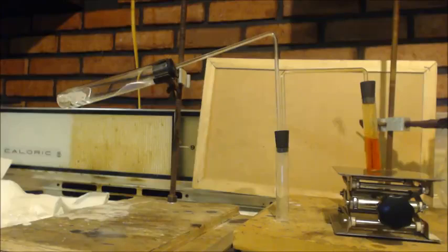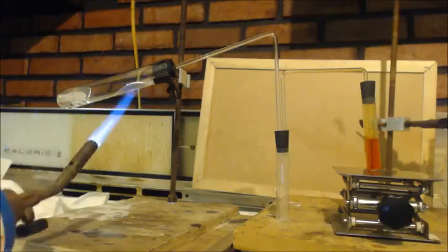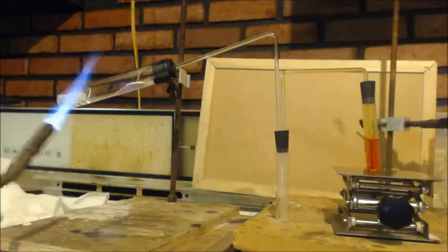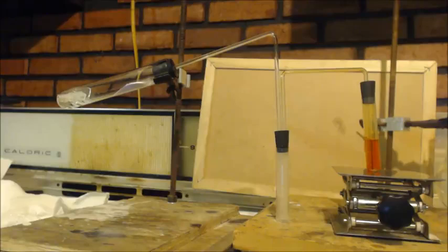It's like I'm heating it up too much here. You can see it filling up with ethanol right now.